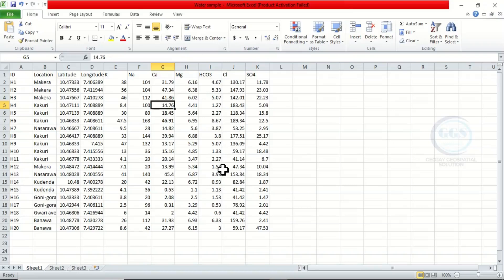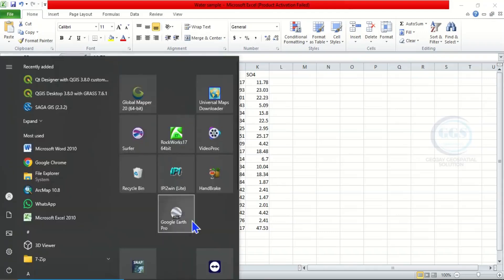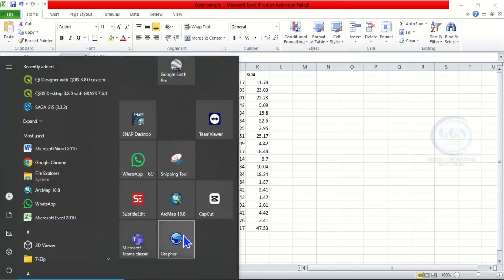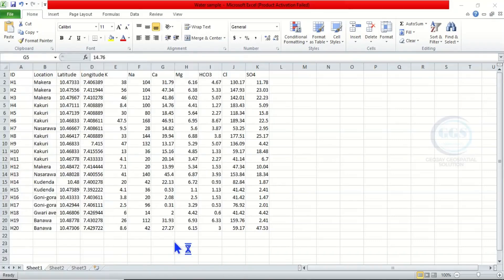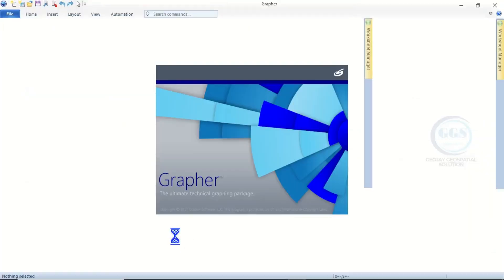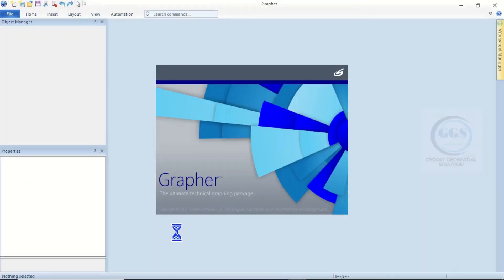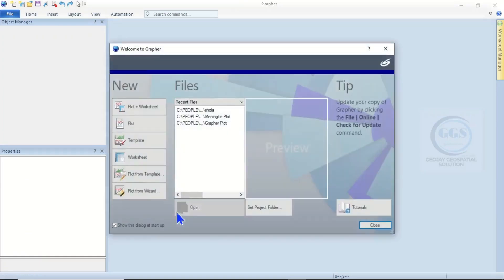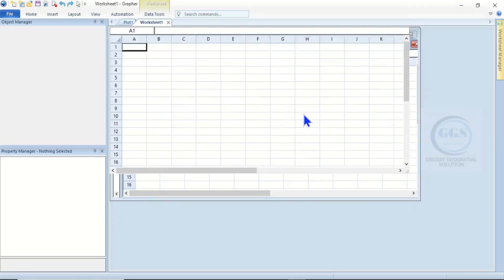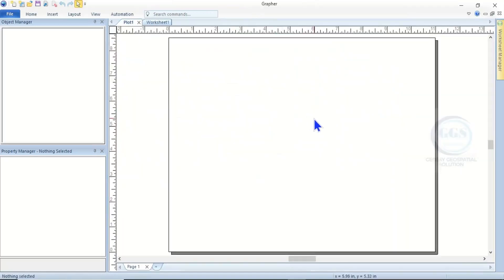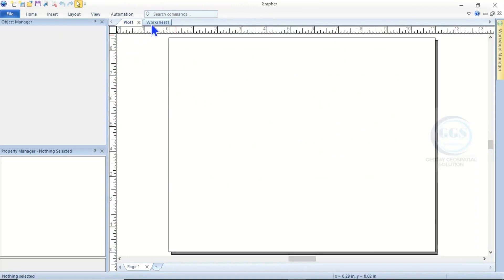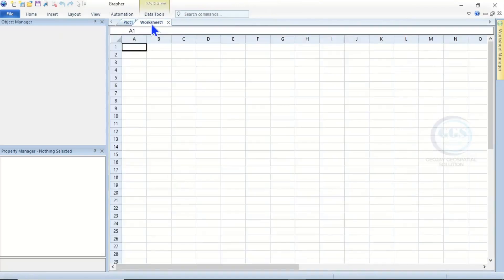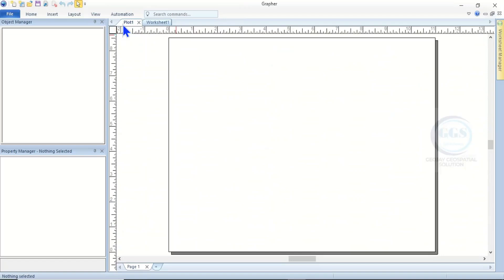Let's launch Grapher - click on it to launch. This is the interface of Grapher. Let's close this. You can see the plots and you can see our worksheets. Let's go to plots because we want to plot the Piper trilinear diagram.